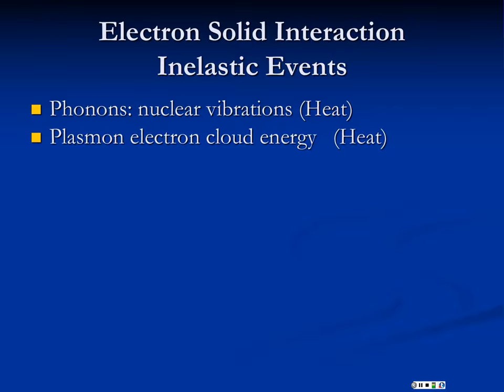They can also give up energy to the electrons in the solid or in the target, and that's called a plasmon. So those are really cool terms. Sounds like something that Mr. Scott would use, or whoever your favorite Star Trek engineer is. But these are actual scientific terms, phonons and plasmons, measures of kinetic energy of the particles.